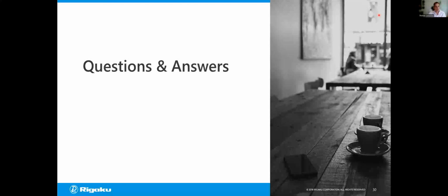They're curious how accurate the crystallinity test is. And I think part of this is not necessarily within the Rigaku software, but part of our analysis, right? Yeah, sure. There are many ways of doing percent crystallinity, and the numbers you get will depend on the approach you use. The different approaches will give you different numbers.